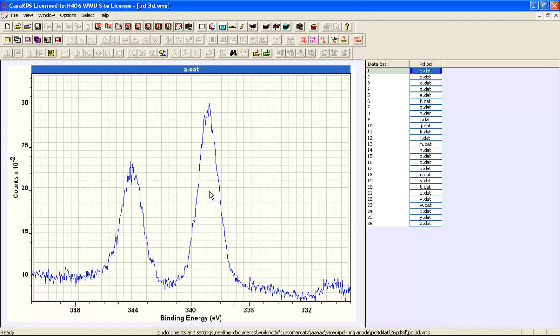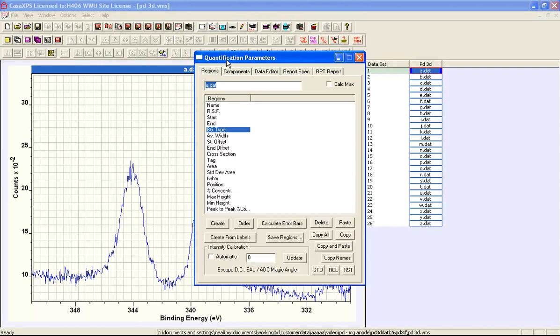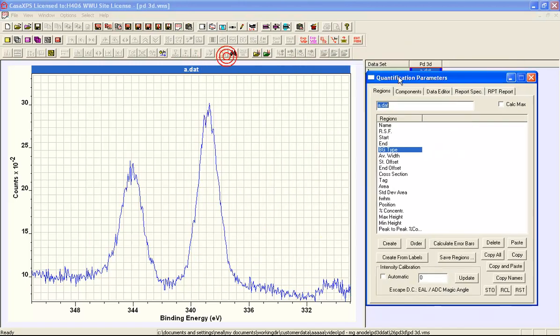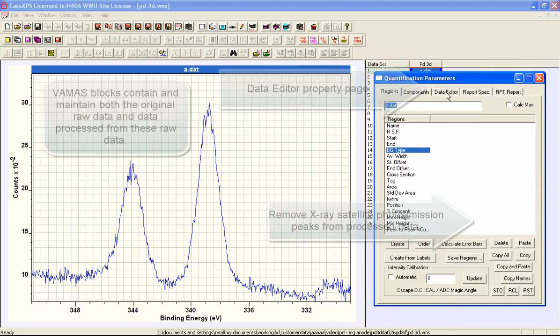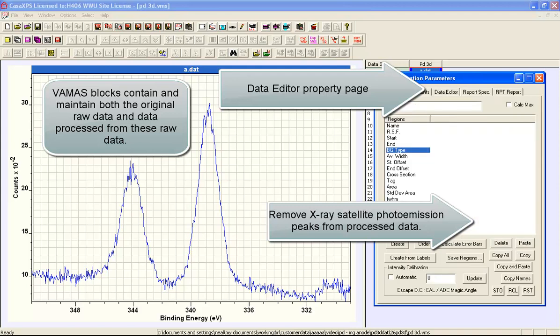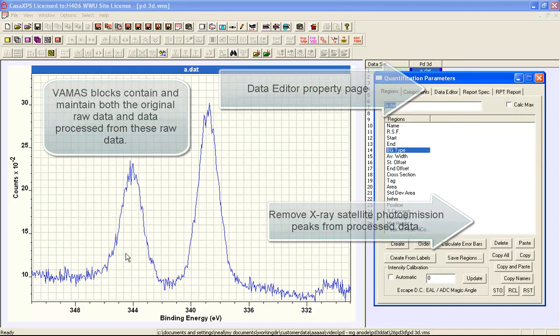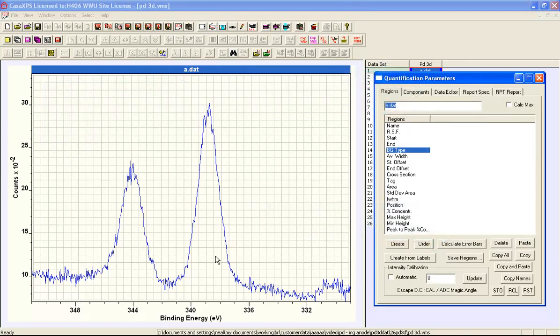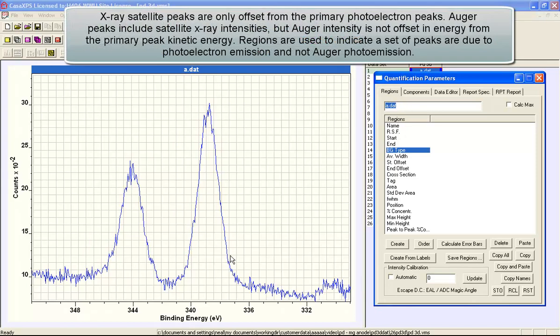So what we're going to do now is use a feature on the data editor property page that says remove satellites. And to do this we need to specify a region that defines the range of a photoelectron pair.